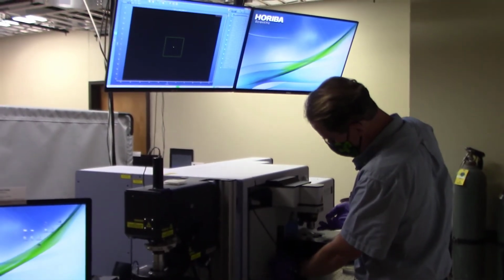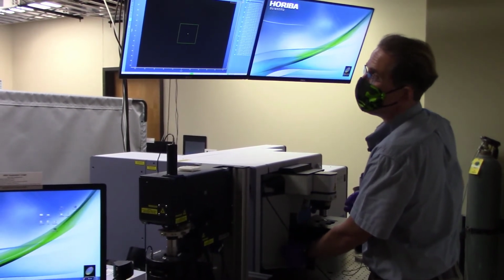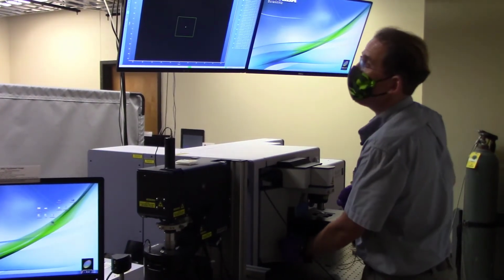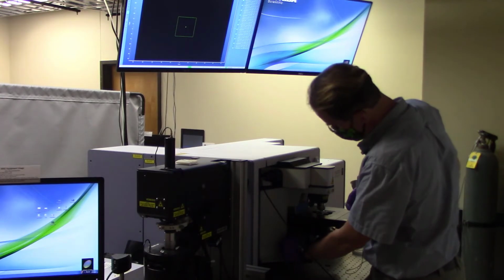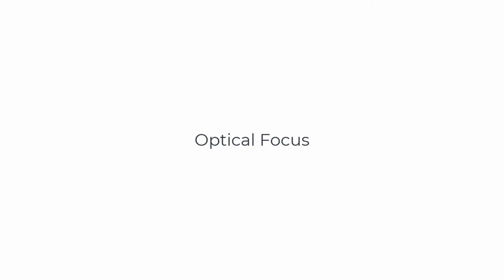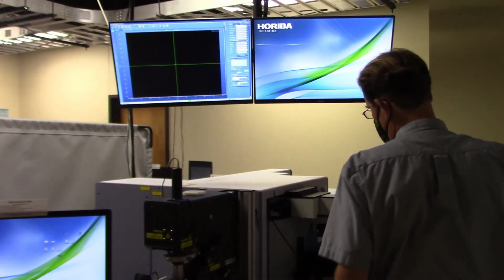So when I was several inches away there, I wasn't capturing really any light back into my objective except for albedo, whatever bounces around the room. And so at this point, when I get near my working distance, I expect to see this screen start lightening a little bit. That is getting shades and shades brighter. And then eventually we will see some kind of a focal plane that allows us to tell what's going on. Slowly focus on the surface of the specimen as follows.